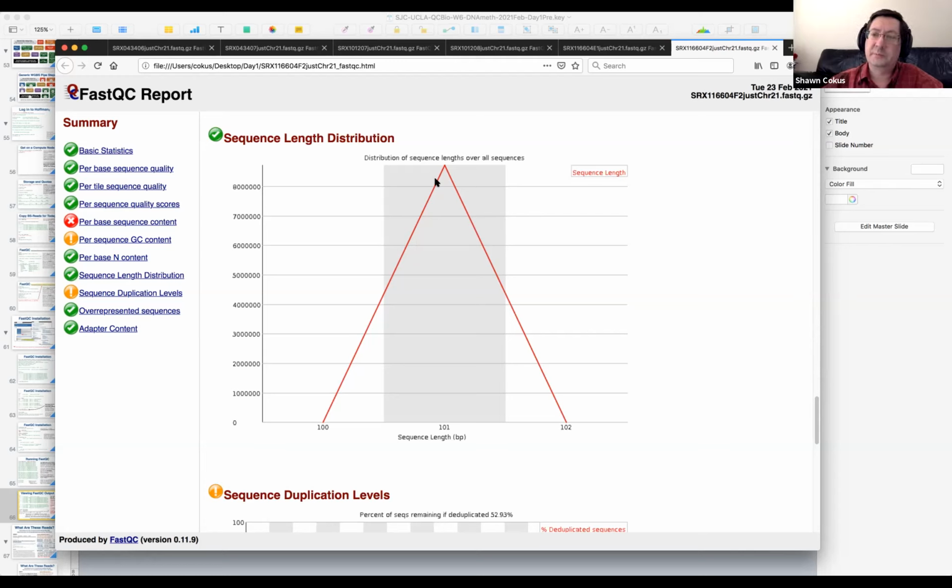The reason is on the Illumina platform, when you have a base, there are corrections from the base before and after in terms of the modeling of the signal that you get in this base, and that's required to deconvolute some messiness from the thousand copies of polymerase, all the molecules in the amplified version of your molecule that the sequencer is sequencing.